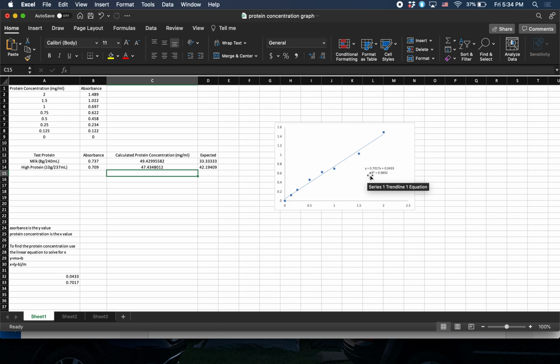So from this, I will finish editing this graph. I will get rid of the border. I will change the color of the data points, and then I will add axes titles. I'll put this onto Word. I need all of you to print this out for class because there are going to be questions on the quiz from this graph. I will not print out this graph for people who do not bring it, so you must print it out yourself and bring it to class.